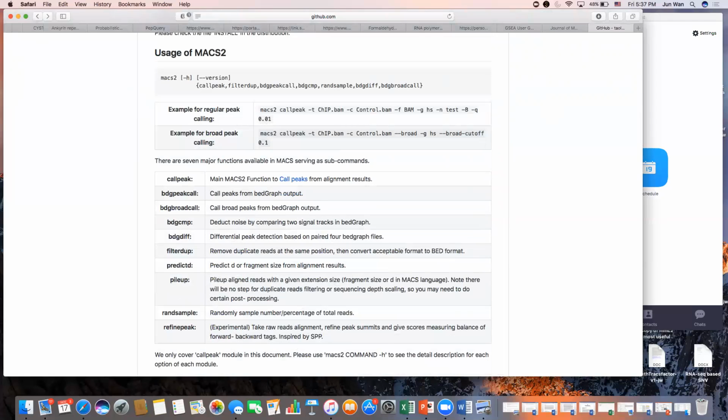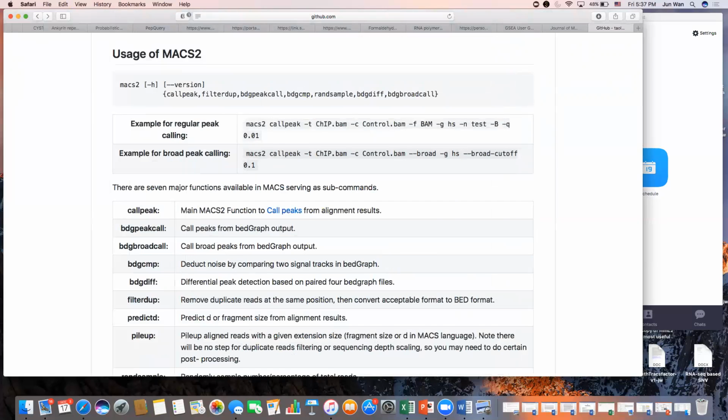So let me make this bigger for y'all. I ran this today, and it works really efficiently and smoothly. I don't think you'll run into any problems with the execution of this program. All of the default options for each program that I'm asking you to run are here and explained. Open up this document and keep it to the side. If the code gets confusing, I've written the options here, and don't be afraid to pull up the manual, guys. Again, I'm giving you default instructions to run a basic program. Don't be afraid to explore, and investigate what these programs can do for you as you move forward.